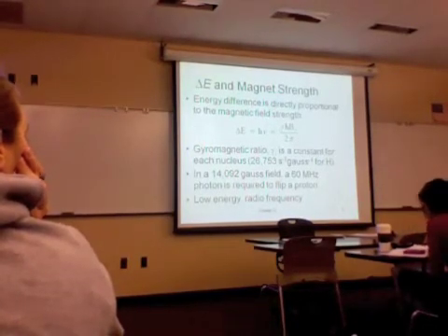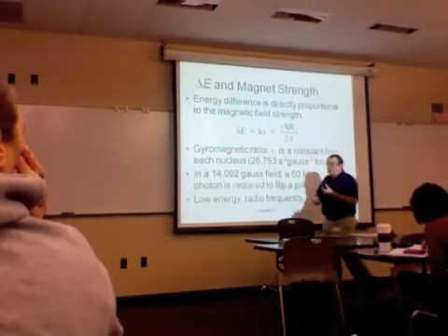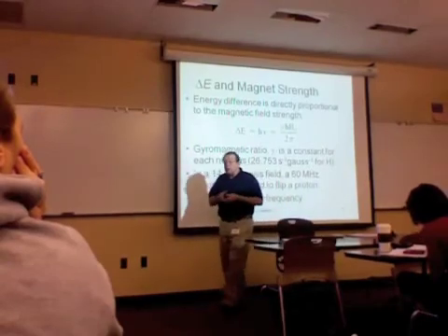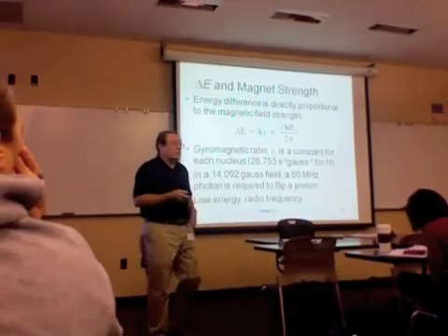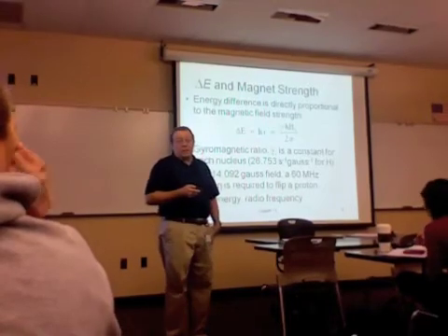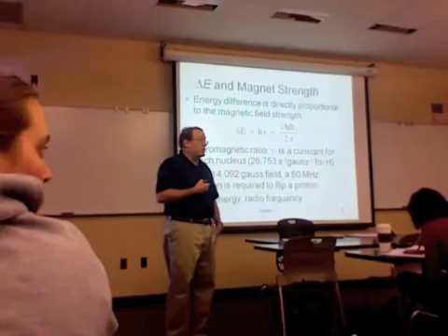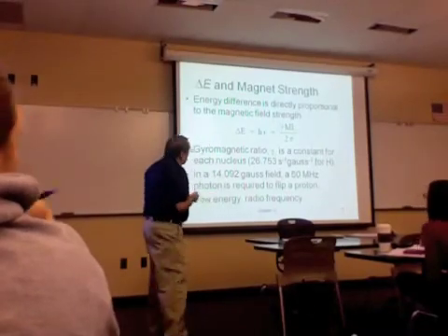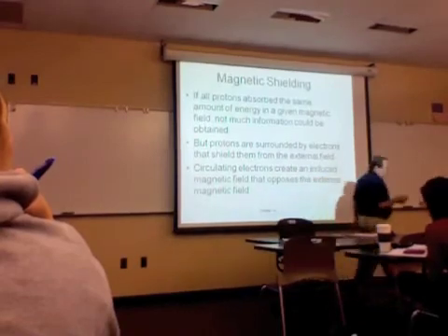And so the magnetic field of the Earth is not nearly strong enough to make hydrogens go into these aligned or anti-aligned states. Does that make sense? We need to have that kind of a powerful field, so it's about 29,000. This is for a simple NMR system. The nicer ones are even much higher in terms of their magnetic field strength.